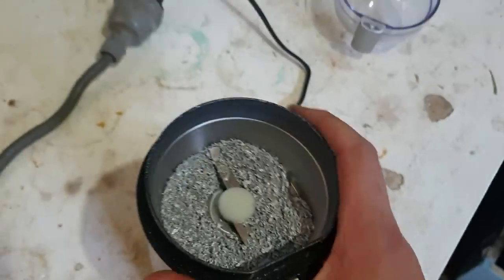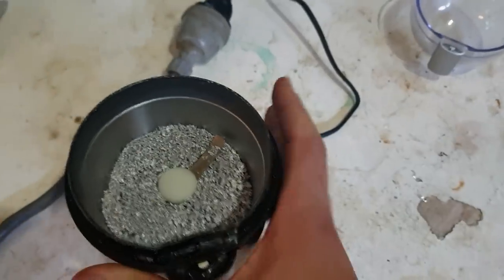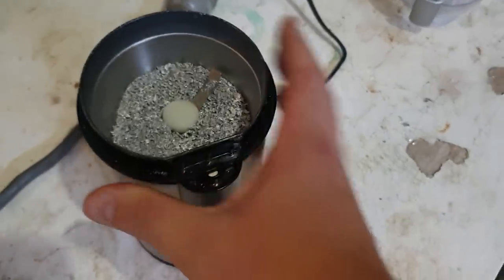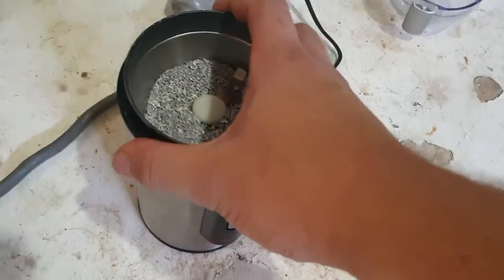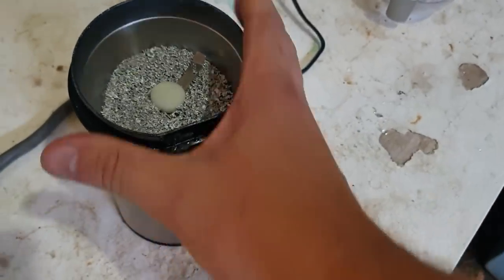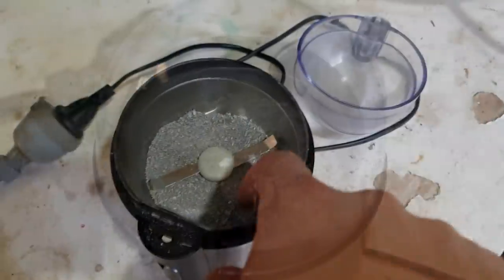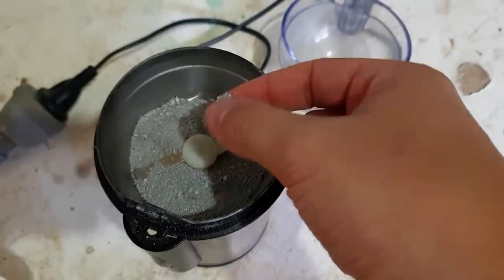It doesn't help that the room temperature is 40 degrees. We'll burn out the motor if we just try and do this for 10 minutes straight — these things aren't designed very well; it was 30 bucks, what do we expect? They're really not designed for long periods of grinding metals. Here it is — it's fine-ish.